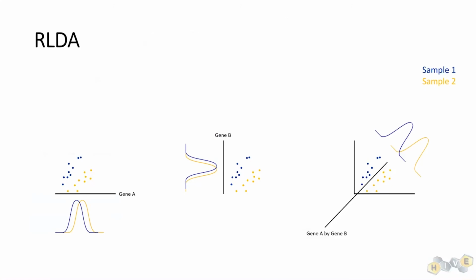So where PCA tries to maximize the variance and it doesn't care what population the sample comes from, RLDA tries to maximize the separation of the data points. So in this example, I'm showing you 2 dimensions because that's easier to visualize that way. It's at least a good place to start. But you could do this with a 3-dimensional plane or a 10,000 dimensional manifold. We wouldn't be able to plot that and show you what it looks like because that wouldn't make sense to a human brain, to try to represent that many dimensions in some sort of graphical representation. But plots are just vehicles to help us understand the data anyway, and so they have a scope of utility like anything else.